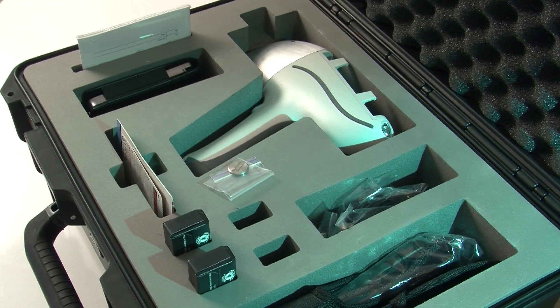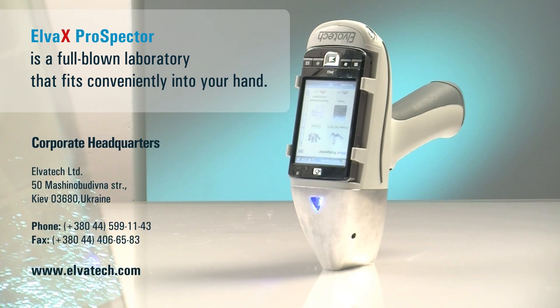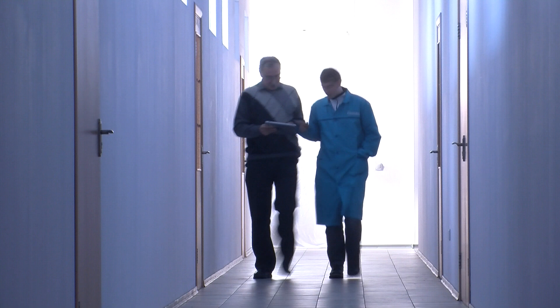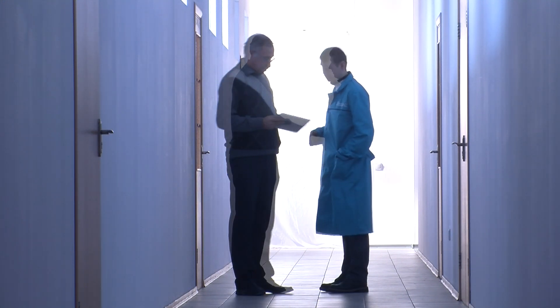A spare battery ensures that your spectrometer is always ready for operation. Elvax Prospector is a chemical laboratory in your palm – rugged, efficient and quick. The Elva Tech team is dedicated to delivering the best quality and service in the field of EDXRF analysis, meeting your unique requirements.